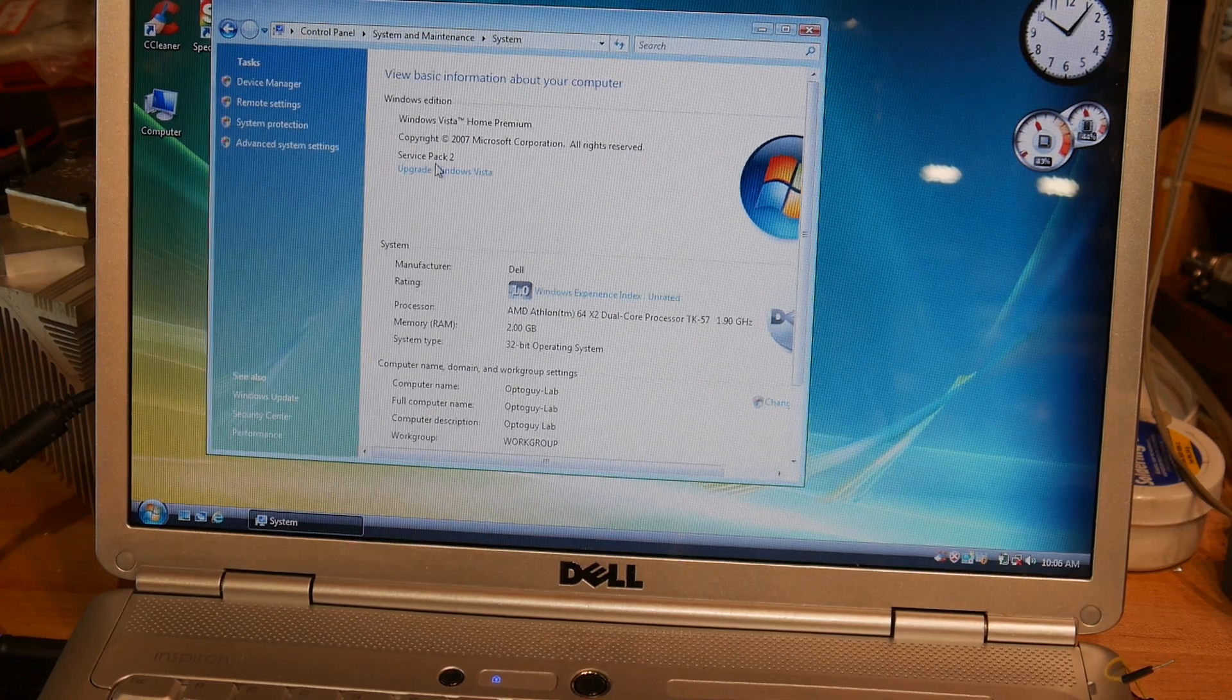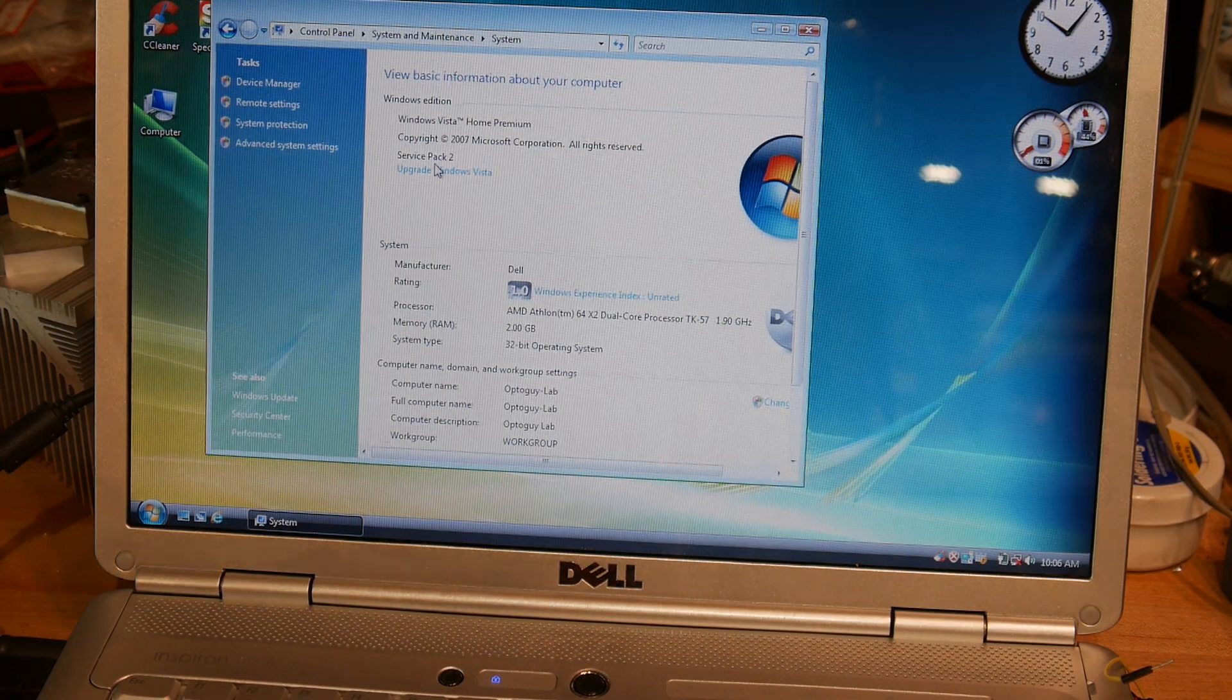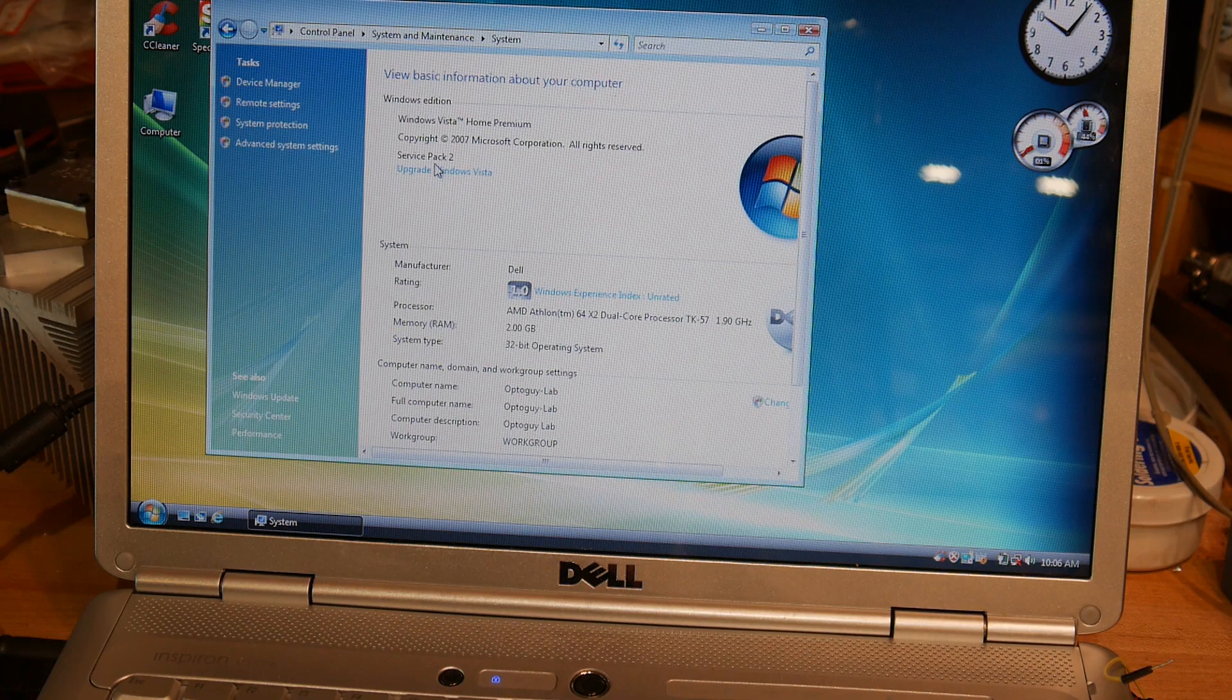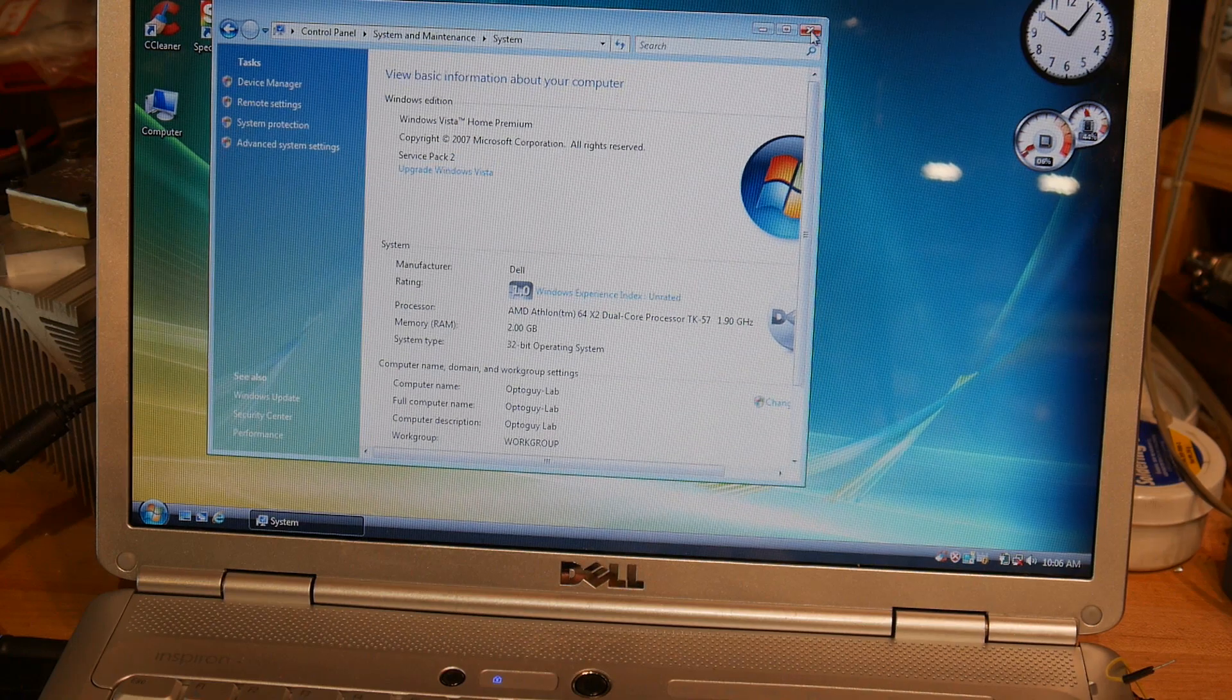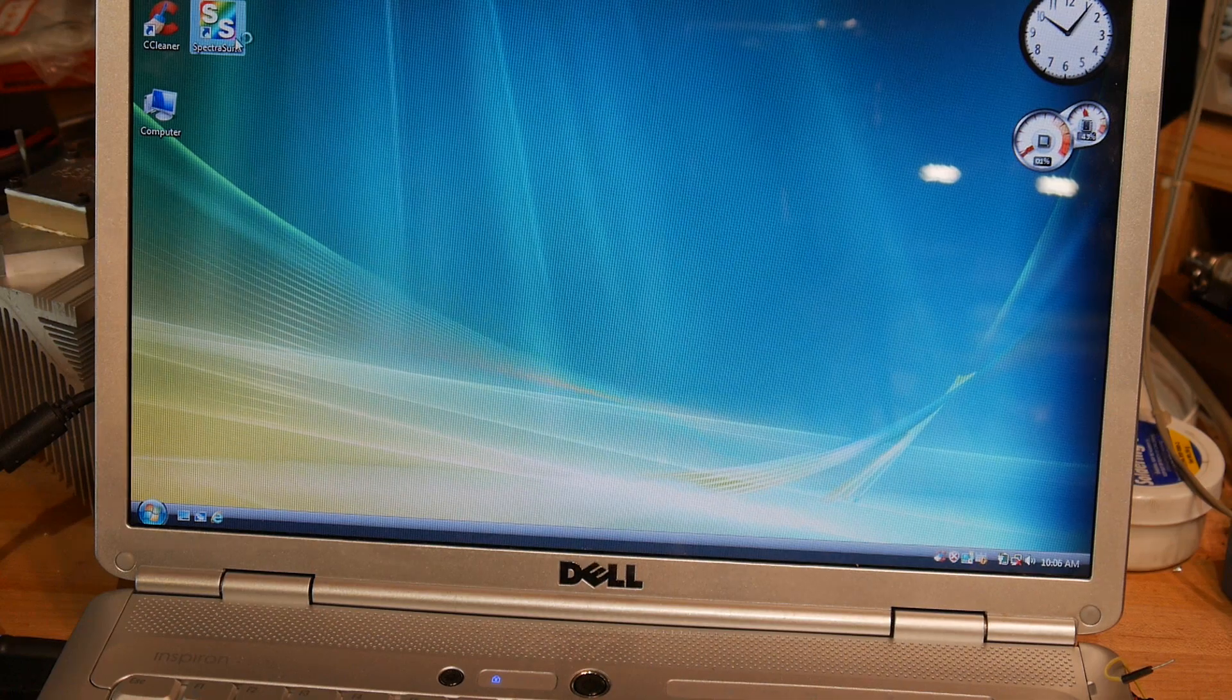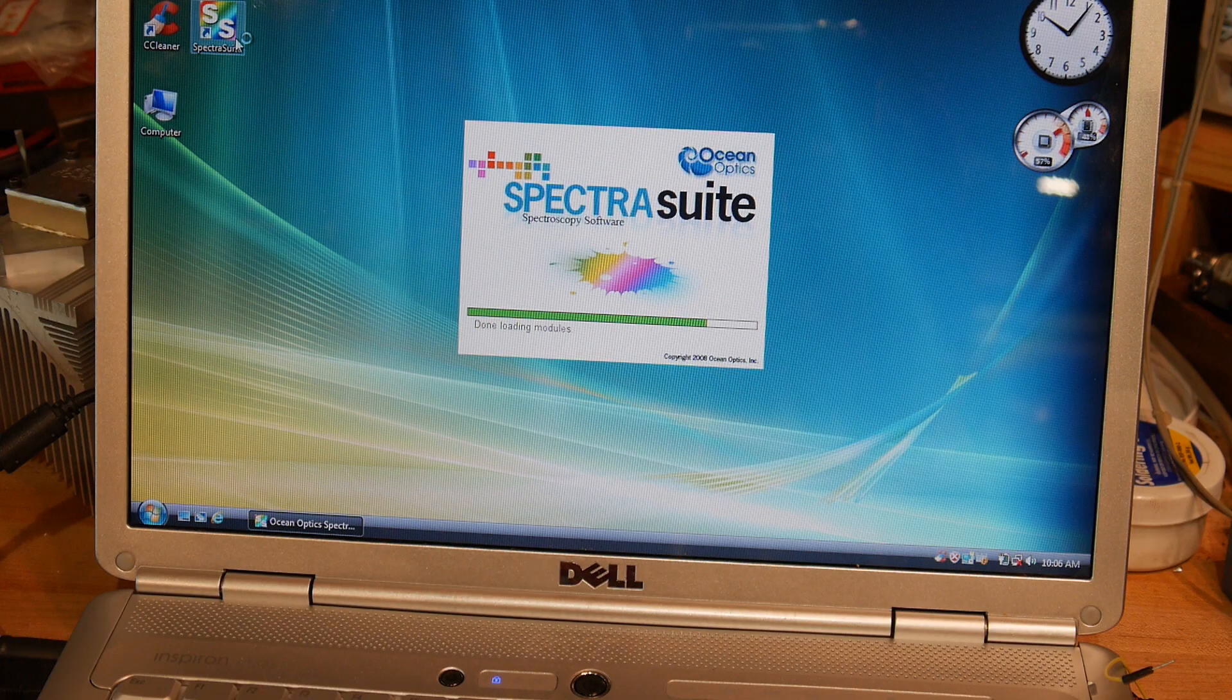So it is a Windows Vista Home Premium, Copyright 2007 Service Pack 2. It's an old AMD Athlon. So anyway, it's a very old machine and I keep it around just for this. So there's a program here, Spectra Suite, that's Ocean Optics.